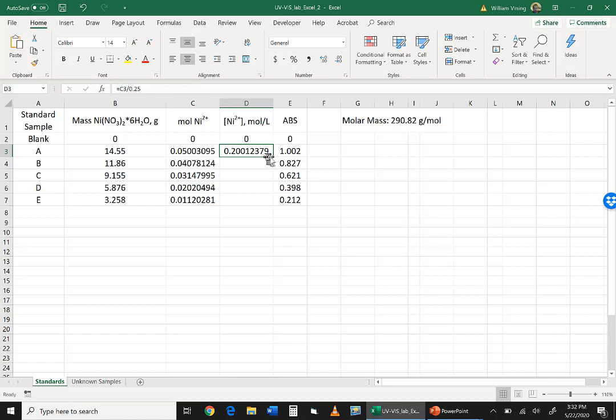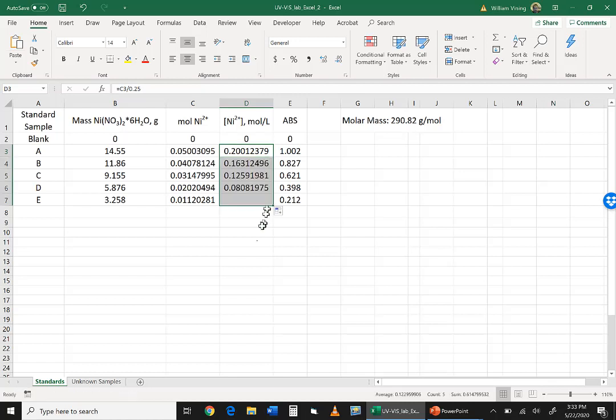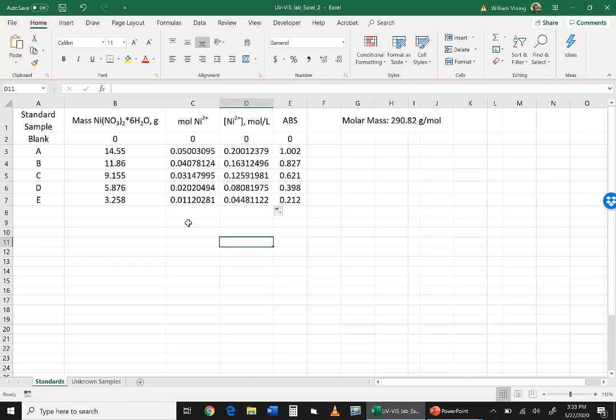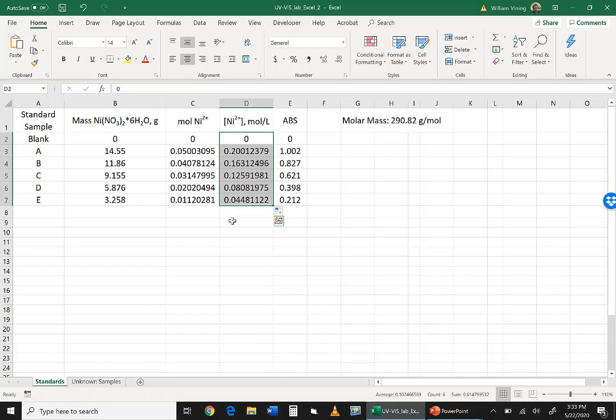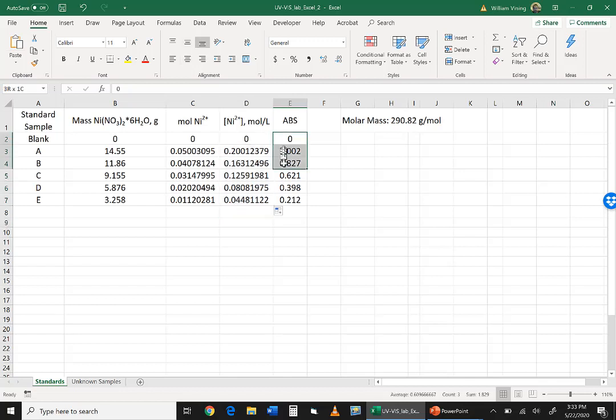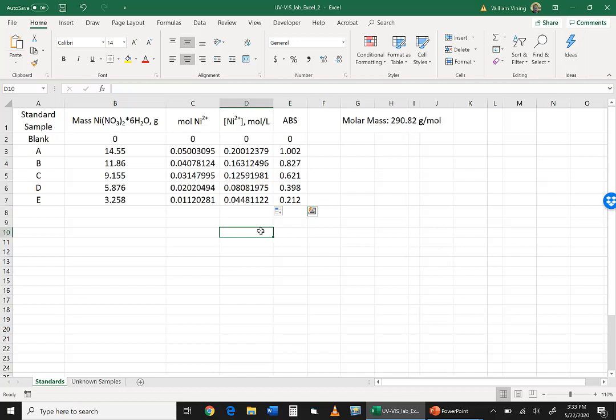And so that gives us our concentrations. And so again, you take the little box on the bottom right, drag that down. Okay, and so now we have our values we need for our plot. The x-axis, we have these values here. Those are the concentrations. And the y-axis, we have these values here. Those are the absorbance units.